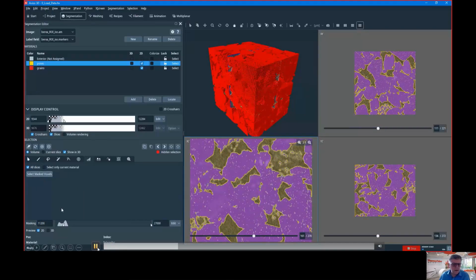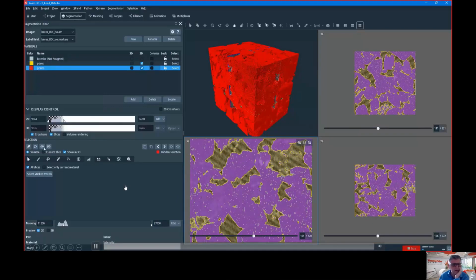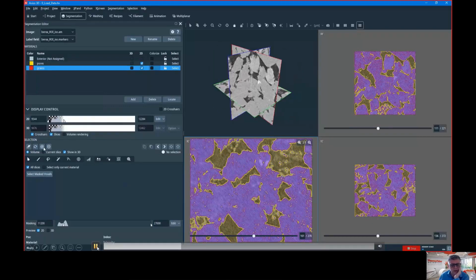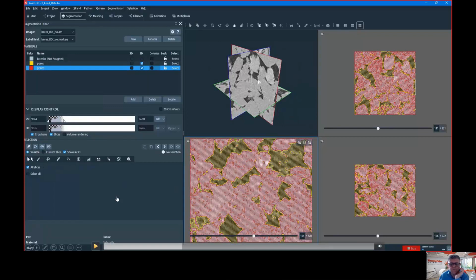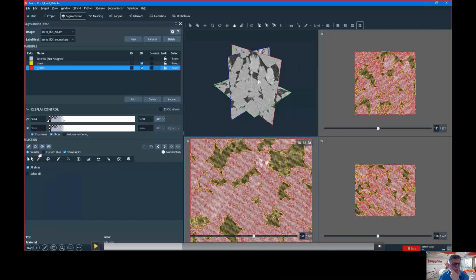And you see quite a lot of clicks. Why so many clicks? Because this tool is very generic. It doesn't know exactly what you want to do. So it's super flexible. You can do everything and the opposite of everything. So it's an advantage and a disadvantage at the same time. When you create a software that is very flexible, then you have a lot of clicks because it's not a predetermined workflow. You have plenty of options, plenty of widgets, plenty of buttons. For a beginner, this is quite complicated, but we do training.